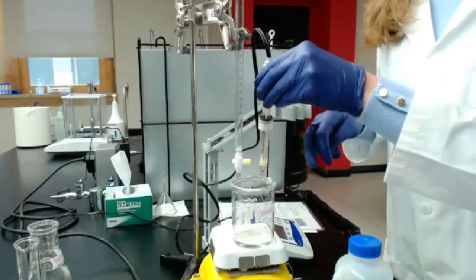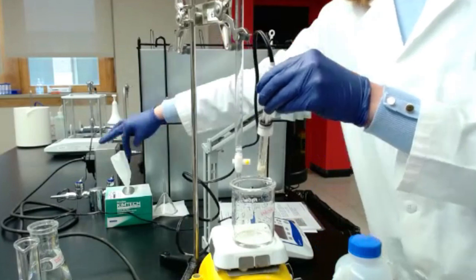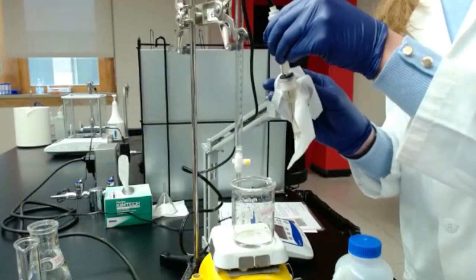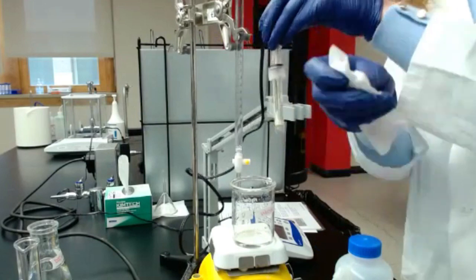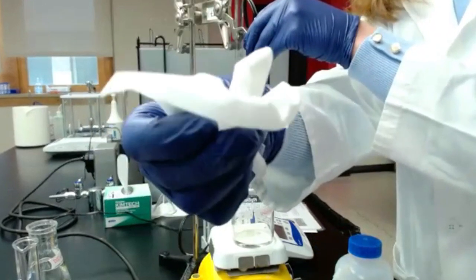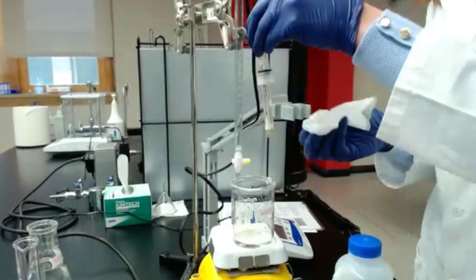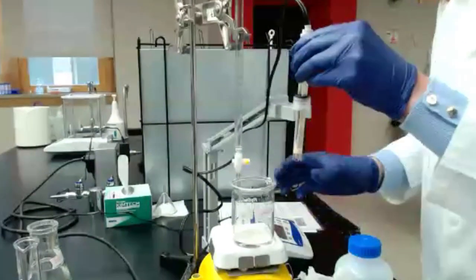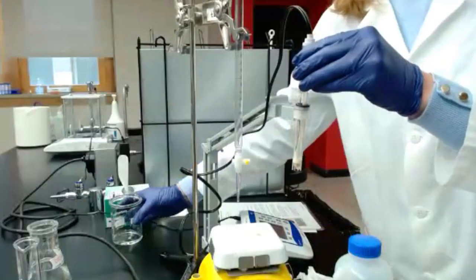Once you rinse, after that you can dry. To dry, to make sure you don't have any remaining water, you can use a soft tissue or a clean wipe, really thin, to avoid scratching anything. You're going to make sure this is dry.